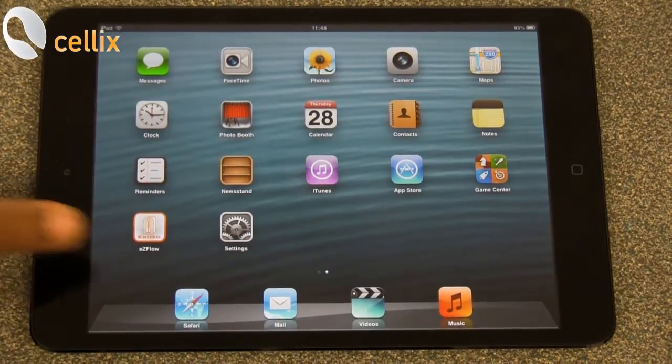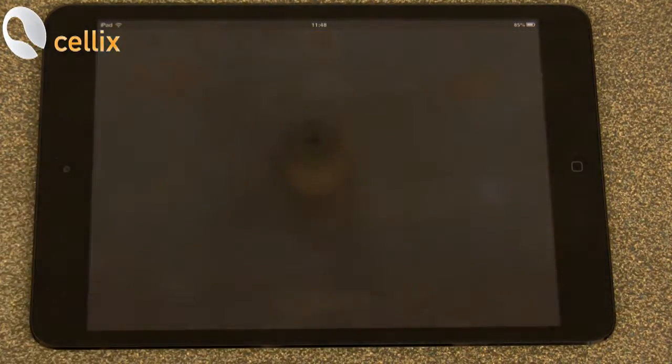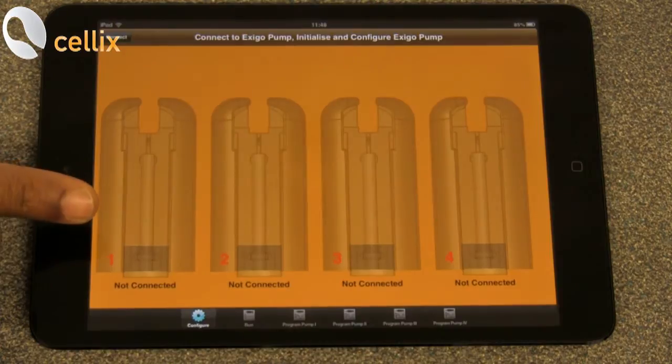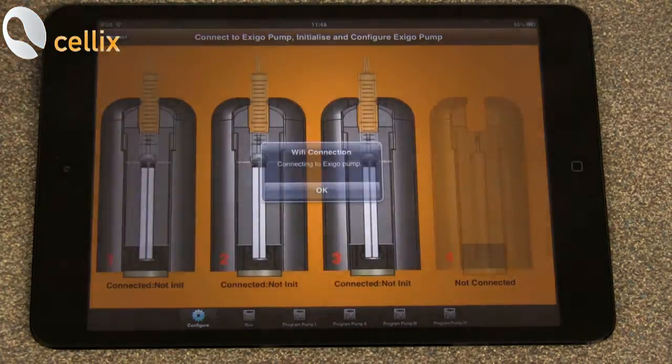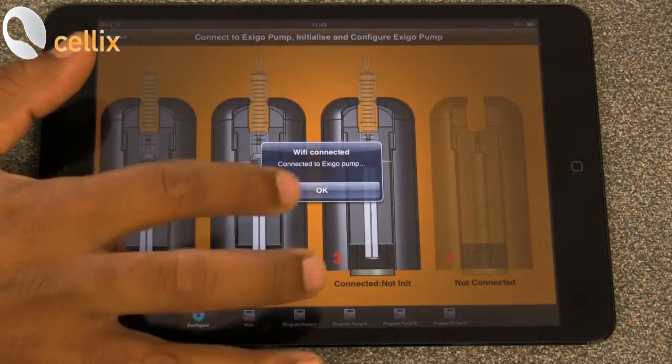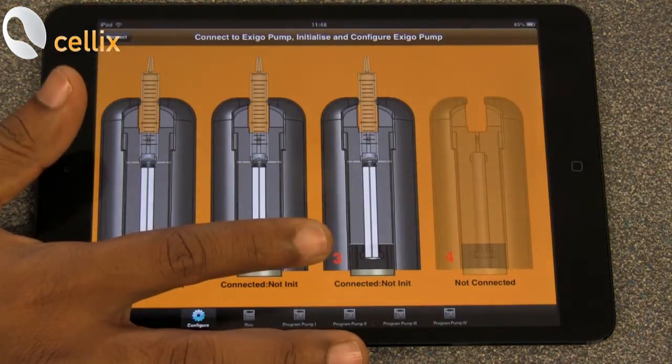To go to the app, you can see this Exigo app. You click that and it opens the program. On the left-hand corner, you have this connect option. You click connect, click OK. So now you have all three pumps detected.